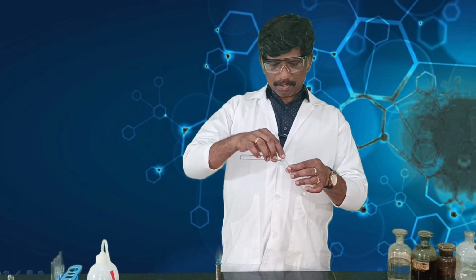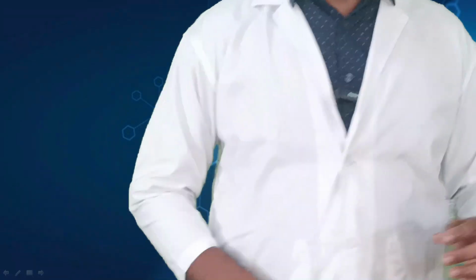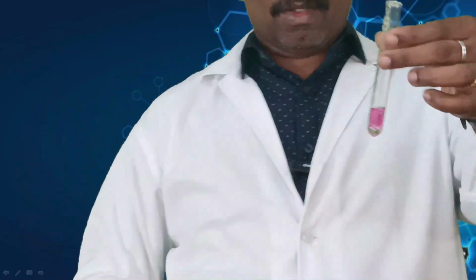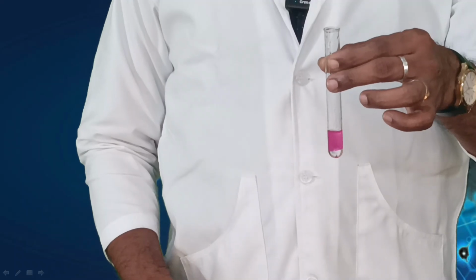Now we shall see the confirmatory test for aldehyde and ketone. In the preliminary test, if you get a positive result for Brady's reagent, it shows the presence of aldehyde or ketone. You have to confirm whether the compound is aldehyde or ketone. For that, you need to do the Schiff test. Okay, take a little amount of the substance and add Schiff reagent, and you will get the formation of pink color. Okay, the formation of this color shows the presence of aldehyde.